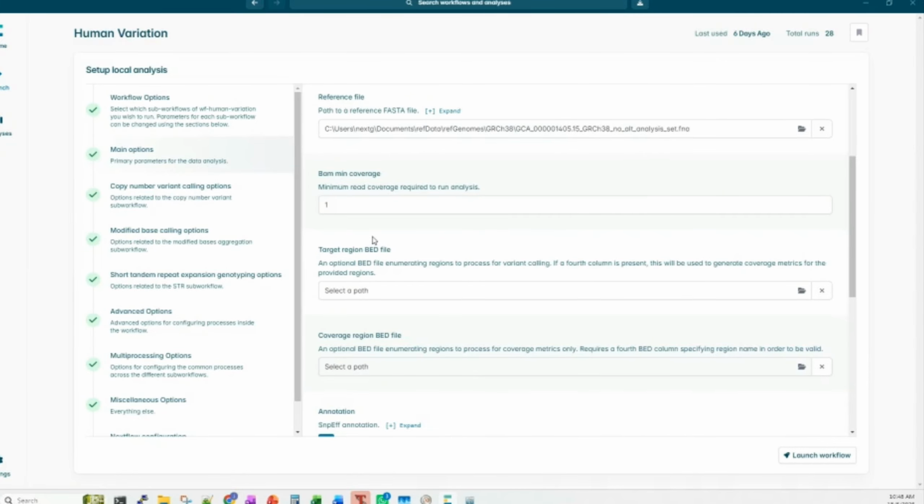For data from targeted sequencing like adaptive sampling or whole exome sequencing, or perhaps sometimes we might not have achieved 30x coverage for the samples, we can also adjust the coverage cutoff over here. So if we do not really set the cutoff, we just want to make it 0 or 1 over here, then the pipeline will proceed even though some regions of our data set might not achieve 30x coverage for the whole genome.